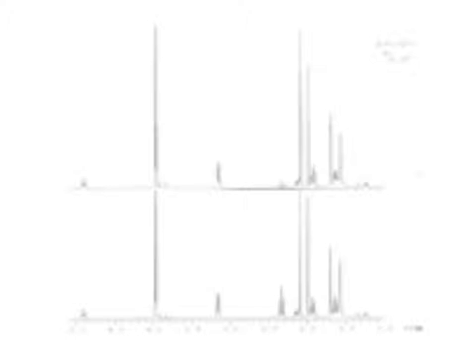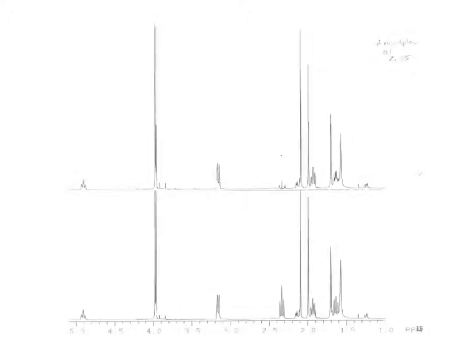Let's look at these next ones. Here's another one. It's decoupling here. And what has changed? Something's changed between the two peaks there, down here. It's hard to see what it is. I think it has a methyl group and it has a water peak next to it. All right, so let's just continue.